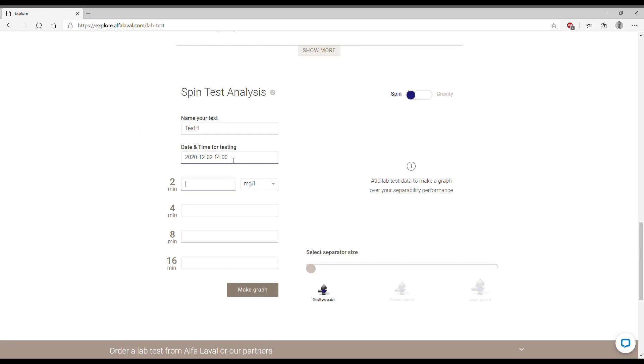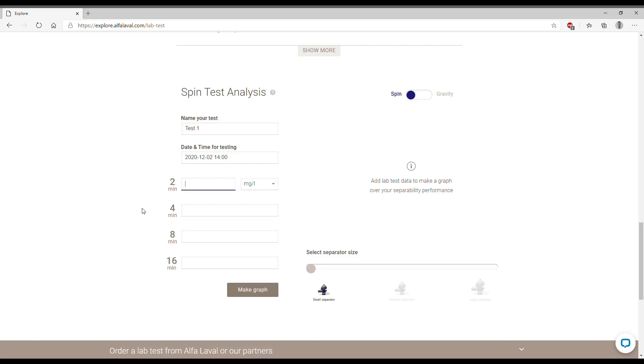Here we are going to enter the results of the chemical analysis from the vials spun at different times. We can see here that we recommend each vial to be spun at 2, 4, 8 and 16 minutes so you should be having results in terms of centrate quality for each of those times.